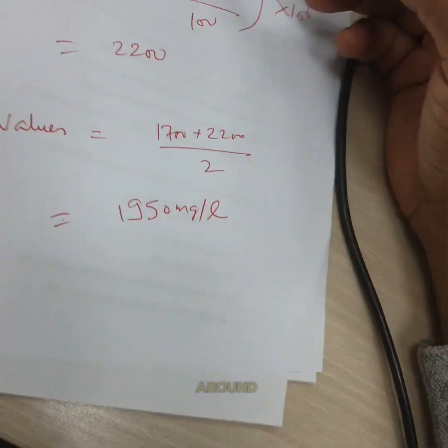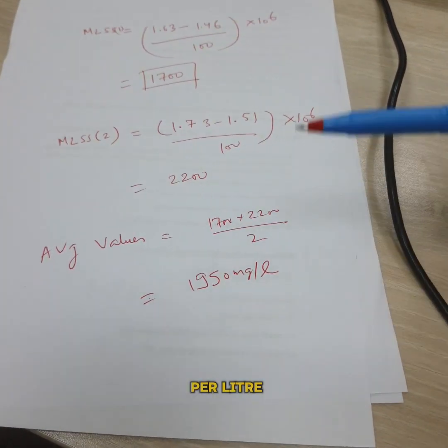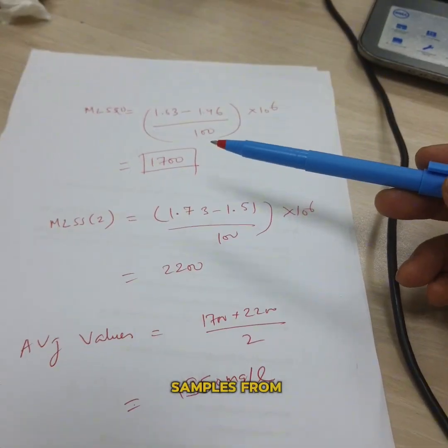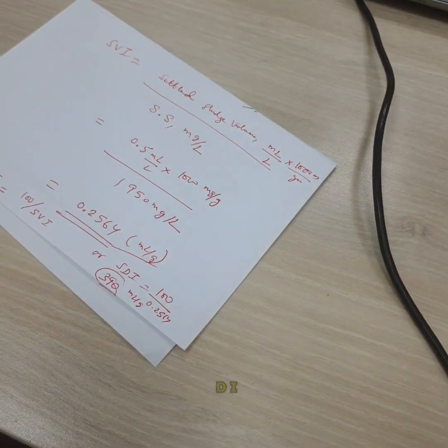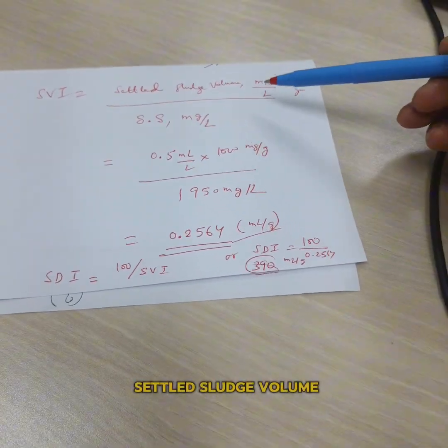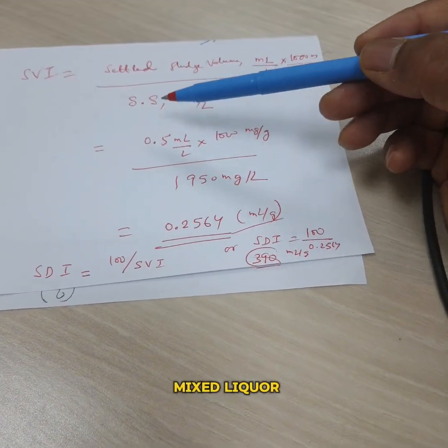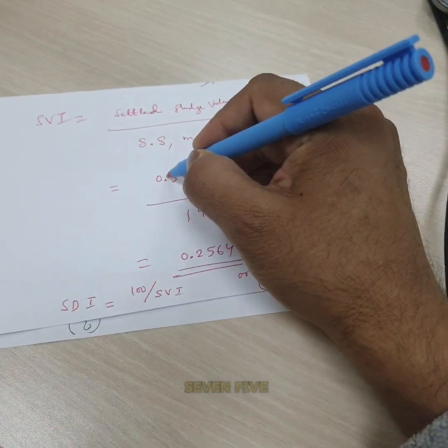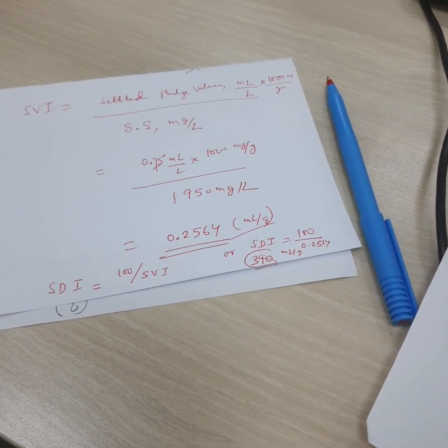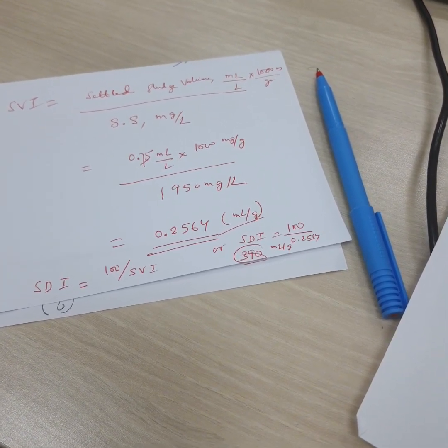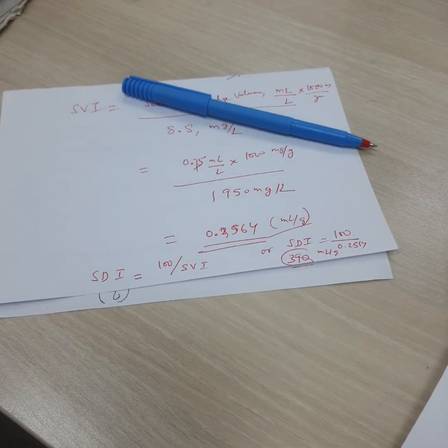Now guys, on calculating the value of SVI and SDI from the experimental result that we got in the lab, MLSS in the first sample was around 1700 milligrams per liter and in case of the second sample it was 2200 milligrams per liter. The average value of both the samples as we took two samples from the same water, so the value is 1950. And our SVI - you know that SVI is the ratio of settled sludge volume times 1000 milligrams per gram upon suspended solids concentration in the water, that is mixed liquor suspended solids. Here even if we take this around as 0.75, for example, the value would be 0.384.